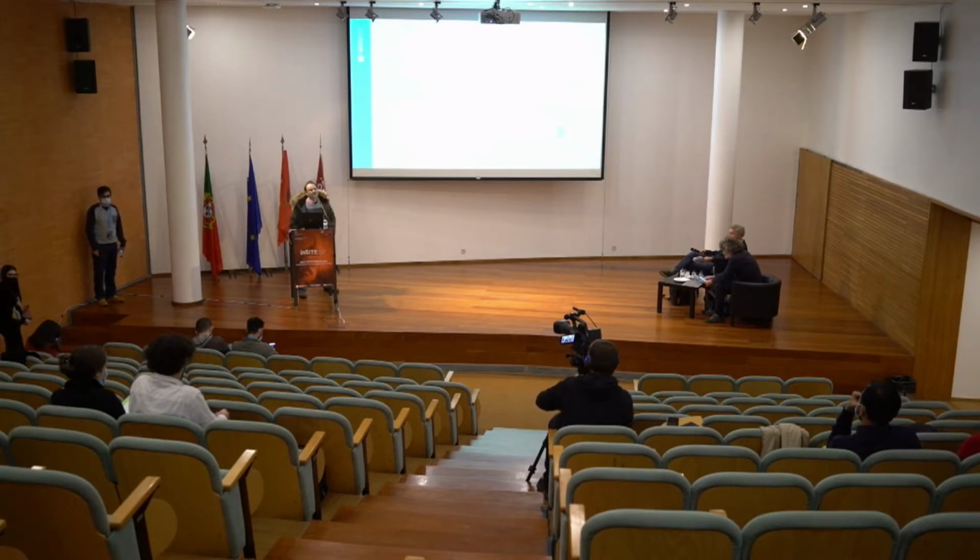Yes, I think if you respect the limits of detection for the threshold of decision of any area, then of course you have a very excellent instrument and a very excellent way to work in the field, or even with some sample preparation. So that's a very good instrument, because the alternative is the low throughput in the lab. So that's it, I think.